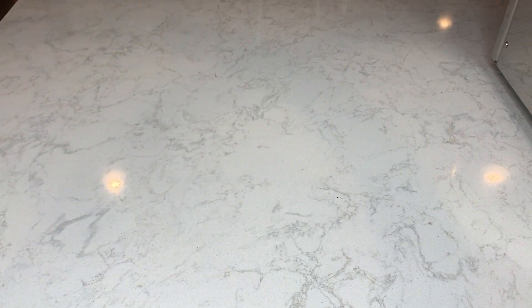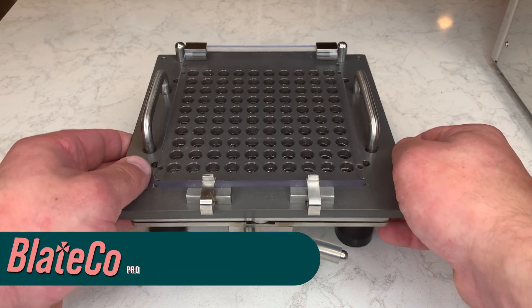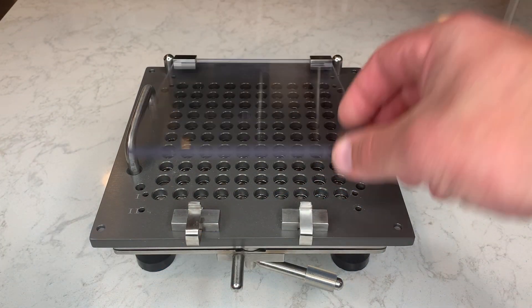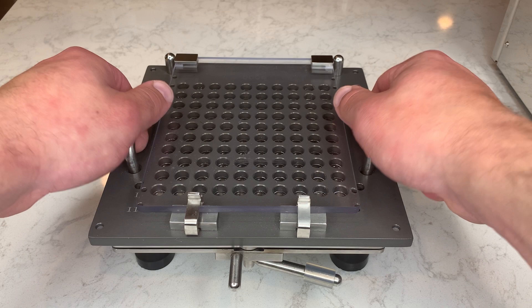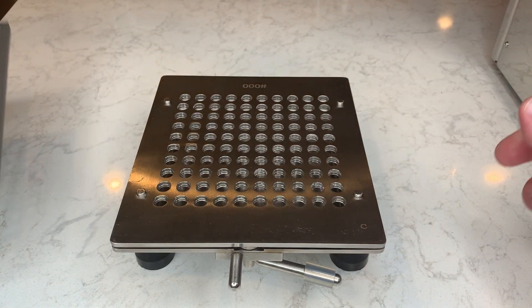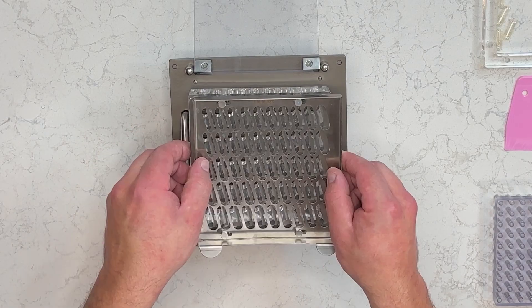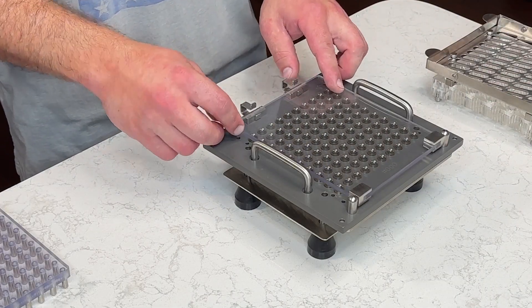And lastly, we have our 100-hole Professional Operation Series, or Pro-Op for short. The biggest difference between this and the rest of the machines we carry is that these use joined capsules, which means you don't have to buy more expensive pre-separated capsules or separate them yourself. It comes with a capsule loading device that drops the capsules in place to be locked and separated all at once.